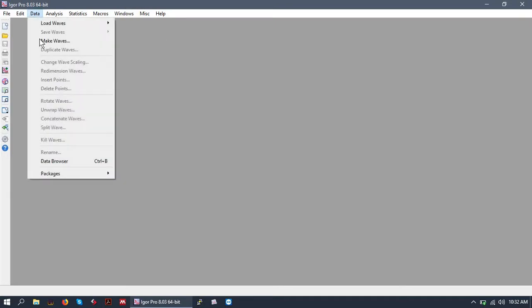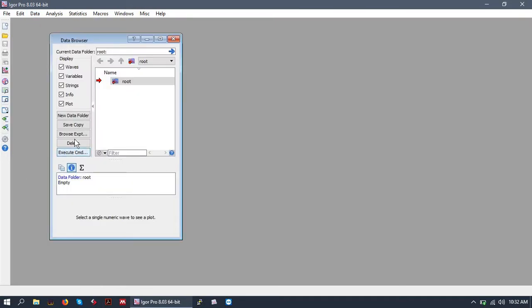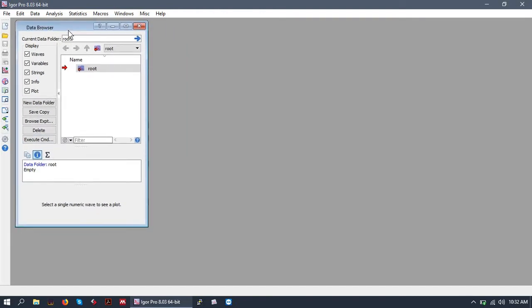To view the data browser, you're going to go to the data menu and click data browser. The hotkey for this is Control-B, which I highly recommend using. Hotkeys are very useful and make things a lot faster when you're running through analyses.